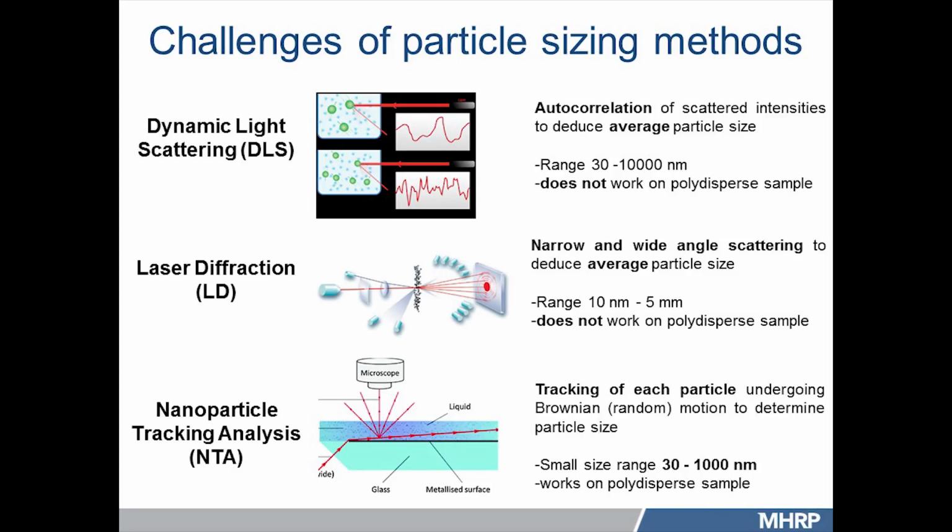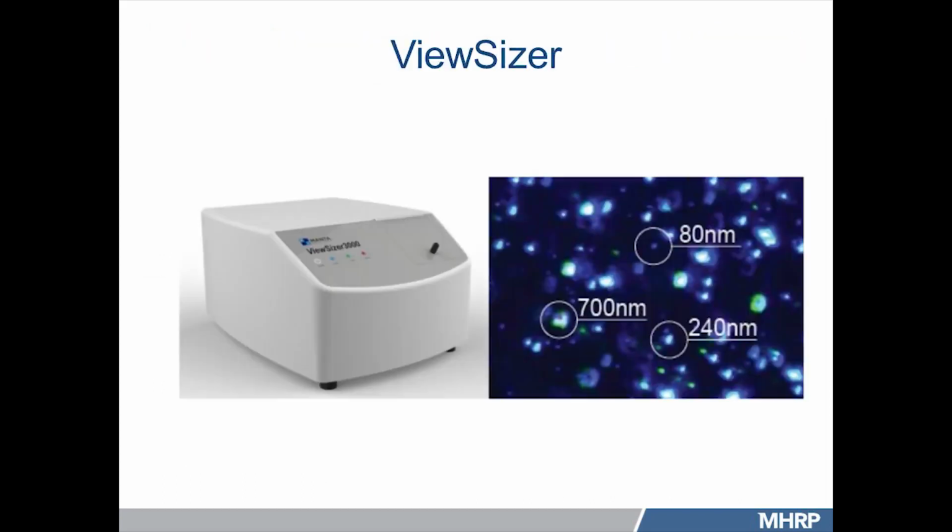But it works on polydisperse samples. We have seen that our liposome formulation has a significant number of particles beyond 1 micron, so you are ignoring a lot of particles beyond micron size. So then we came up with this multispectral nanoparticle tracking.